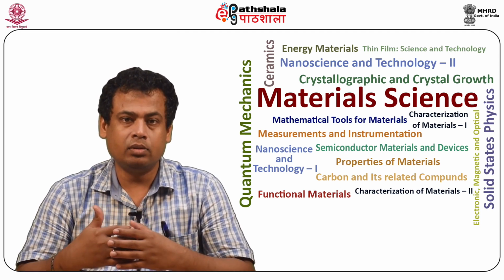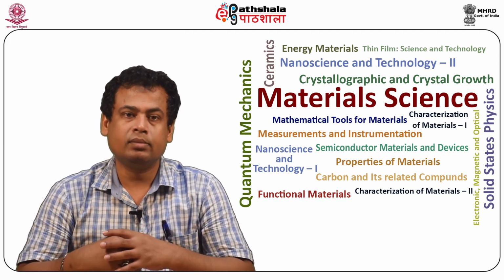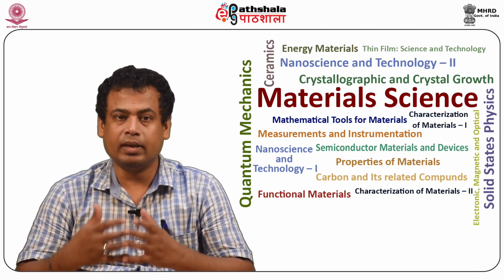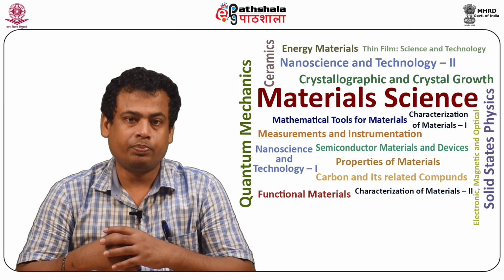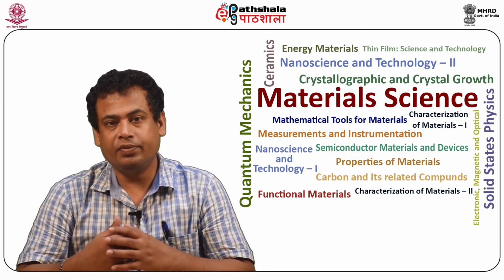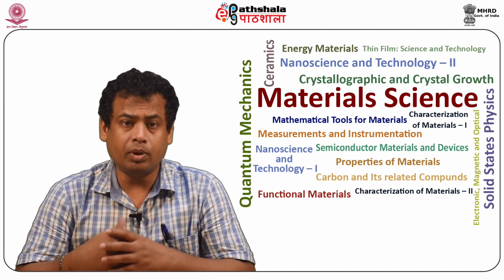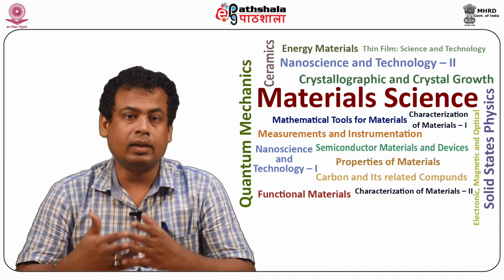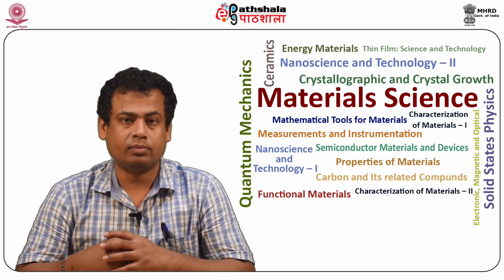The CFE relies purely on the high applied field for electron emission, independent of the tip temperature. TFE has the same property as CFE, but is operated at elevated temperatures.